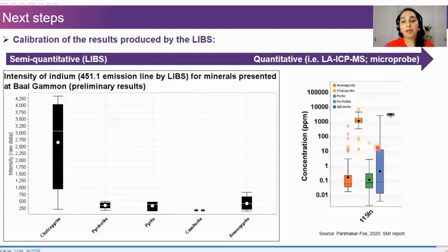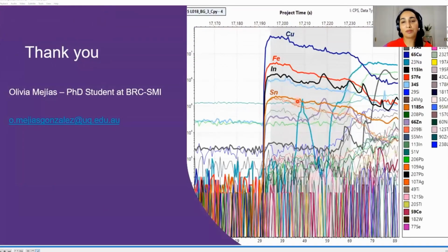With this information, we can see how useful the LIBS instrument is in terms of being transportable and comfortable, with fast outcome information that you can obtain without the need to prepare samples, without needing immense facilities, with a wide variety of elements, and it can also create element mapping. So it's a really good method for elemental analysis in geological sampling. Specifically, it is a really high potential tool for recovering waste rocks and critical metals. Thank you so much for your attention.